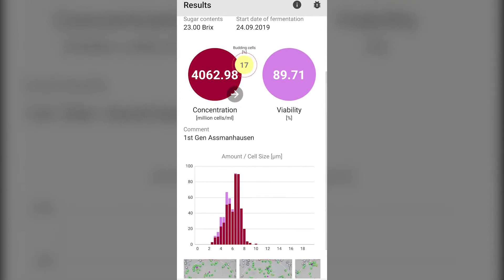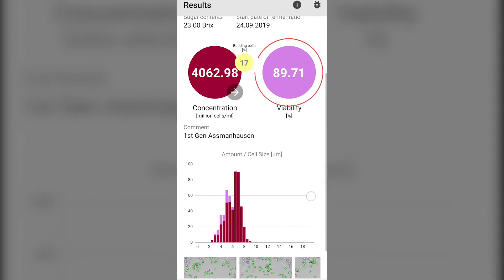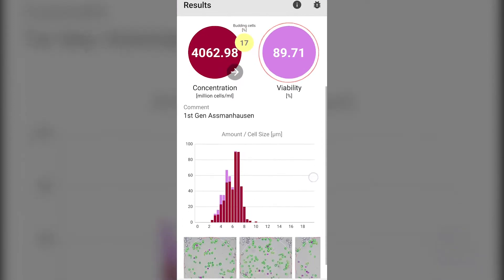In the tiny yellow circle is the percentage of cells that are budding. In the violet circle is the viability percentage.